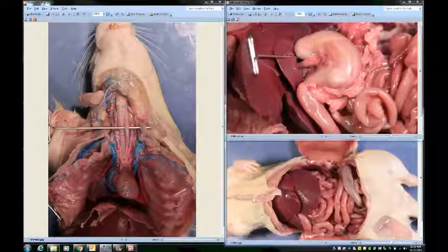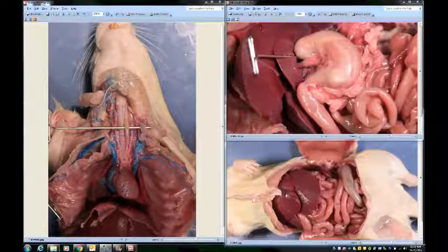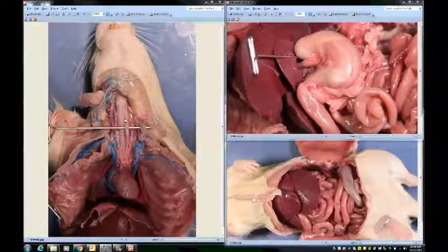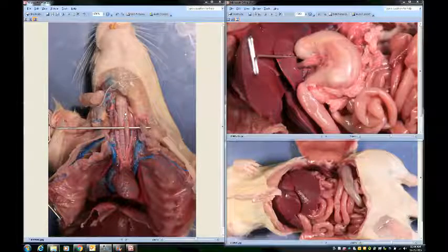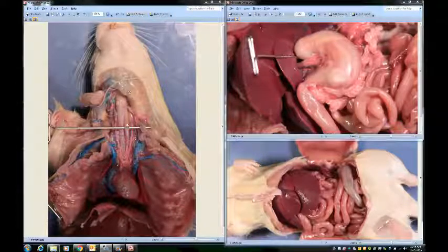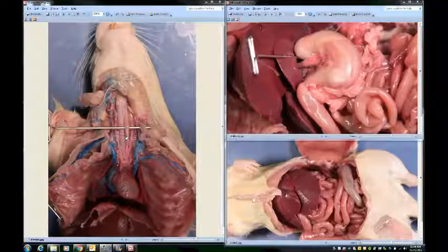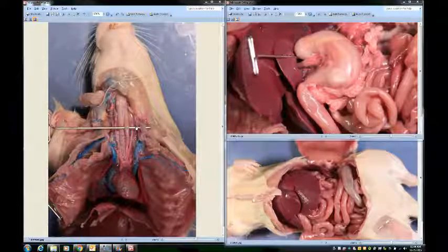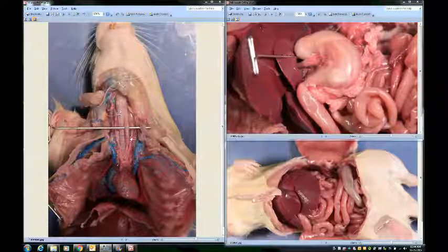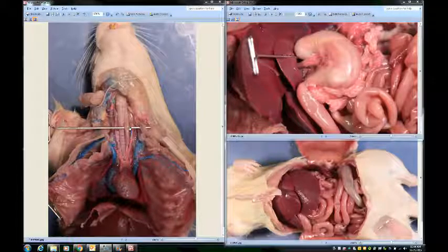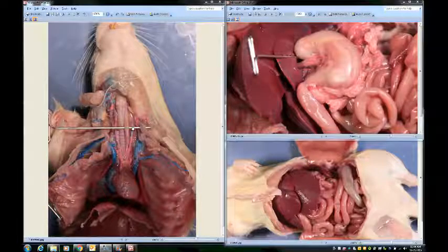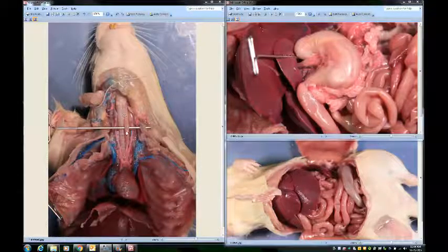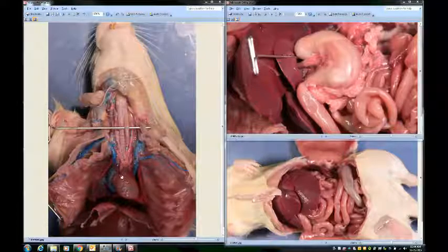Next we'll look at the rat's digestive and excretory systems. Starting on the picture on the left, you can see a dissecting pin, and right over it is this long narrow tube — that is the rat's esophagus. When the rat swallows food, it goes down the esophagus. This one can be very hard to find; usually you have to dig behind the trachea to find it, which is why normally there'll be a pin through it to bring it up so you can see it better.